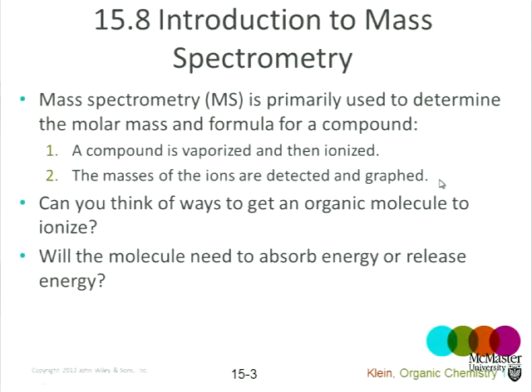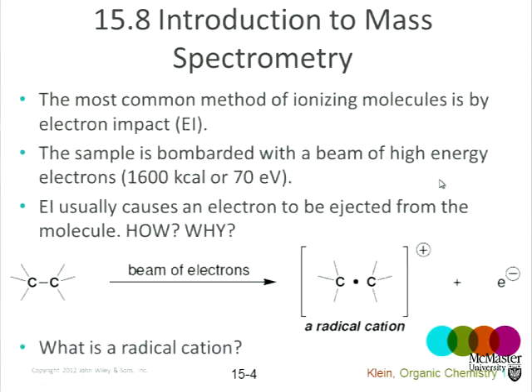If I want to add an electron to a neutral stable molecule, it has to go in an anti-bonding orbital, but the anti-bonding orbitals are there for electrons to occupy. If I put an electron into an anti-bonding orbital, it's going to make the molecule less stable. And we'll see in a little bit that this indeed happens and that bonds fragment when we make molecular ions, and that we also see some of those fragments in the mass spectrum.